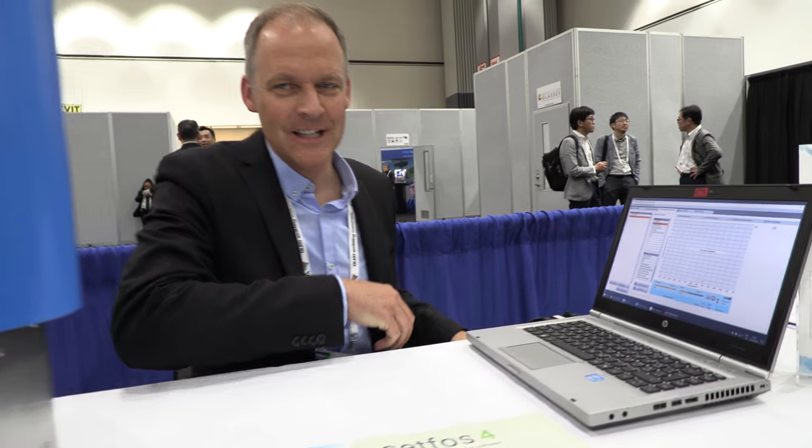My name is Beat Rushtaler. I'm the founder of this company. We have targeted the OLED industry and research community worldwide and this is our newest instrument that helps to improve OLED devices and OLED materials.